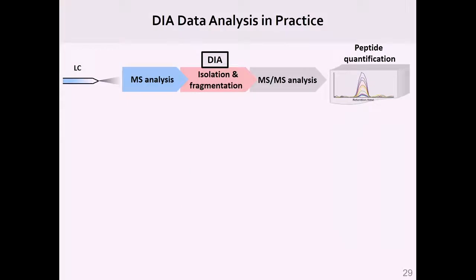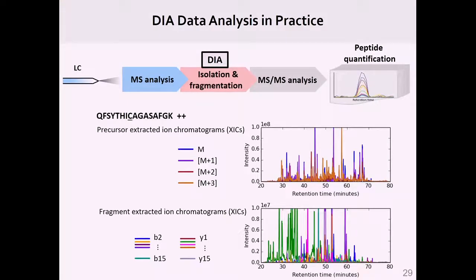So this DIA analysis in practice, again, is kind of a mess. You basically start with a bunch of your precursor chromatograms, and you then take your bunch of your product ion chromatograms. You extract the data, and you need to basically be able to say whether or not you have evidence for the individual peptide, and if so, what the retention time bounds are for which you're going to integrate that peak in order to arrive at your signal from your quantitative data analysis.